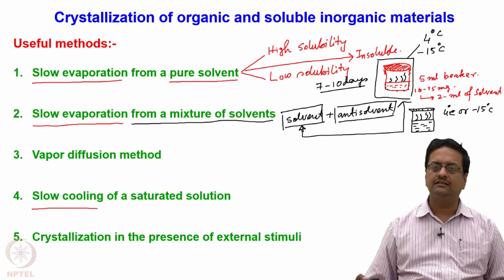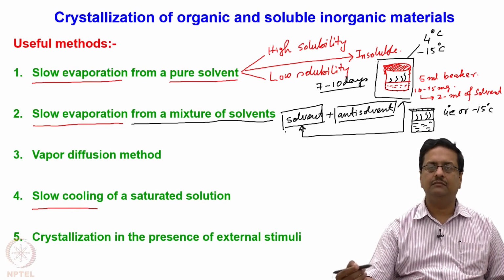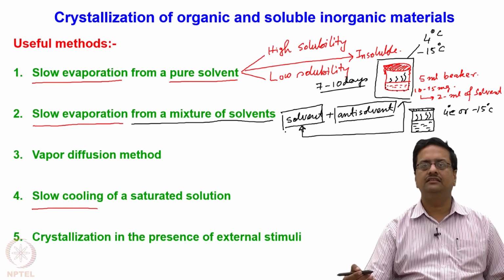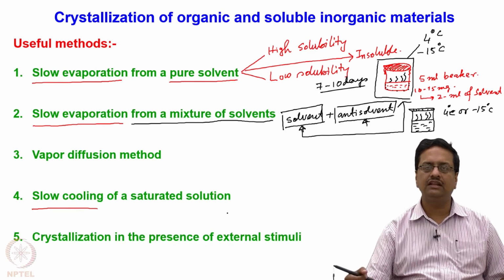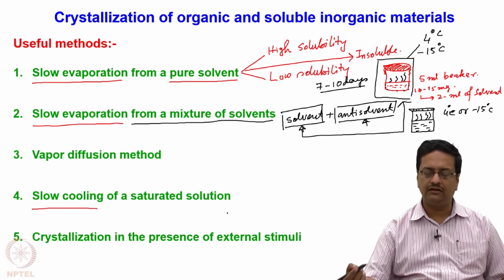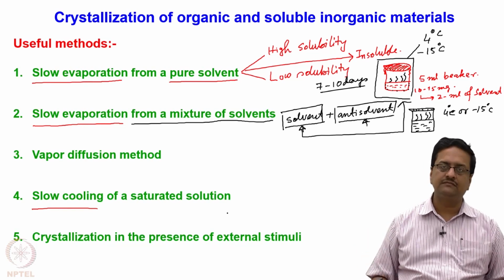Under that condition, when the solvent is much less in amount and your solute cannot stay in the solvent, it starts to grow its crystals, and there may be some amount of anti-solvent still left over, in which those crystals will be floating, and it will be easy to collect those crystals from this particular two-solvent mixture.